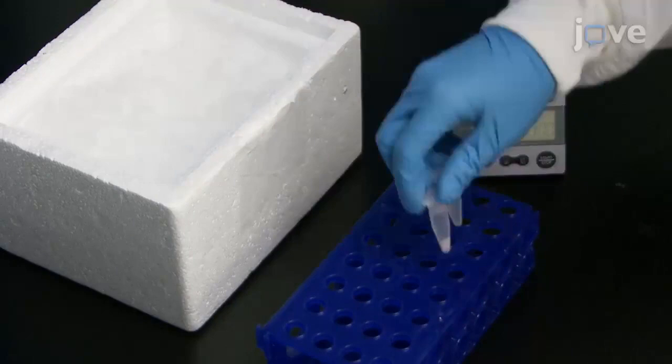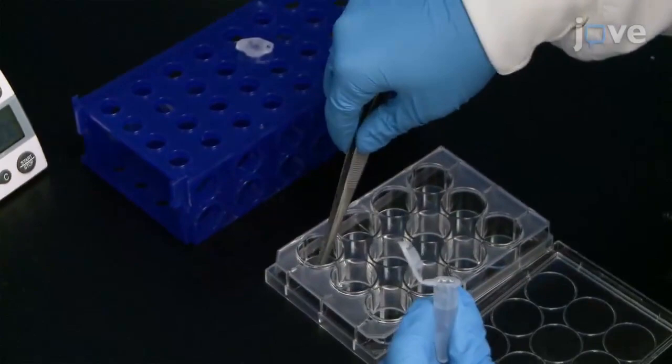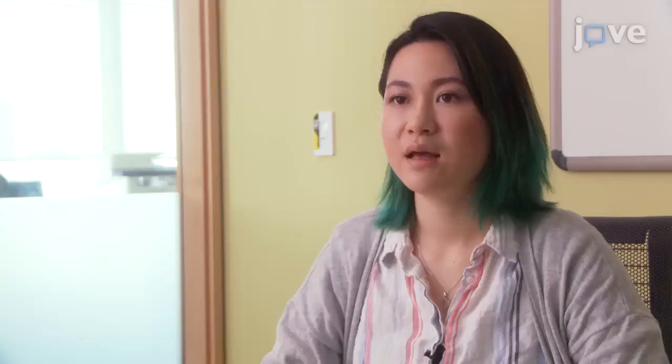After dissection is complete, transfer the dish containing the tissue samples in 1% paraformaldehyde from the ice to room temperature for 1 hour. Then transfer the tissues to either a 12- or 24-well cell culture plate for quicker washing. It's important to remember that the whole-mount staining procedure must begin immediately after dissection and that there are no pause points between each step.